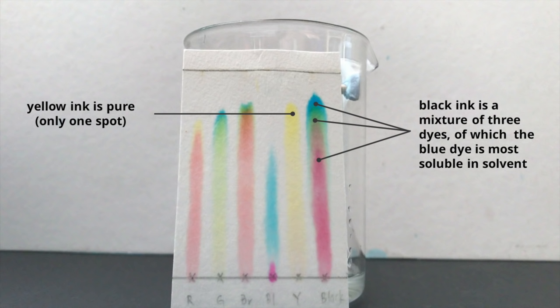The black ink is a mixture of three different dyes, of which the blue dye is the most soluble in the solvent as it has traveled the furthest.